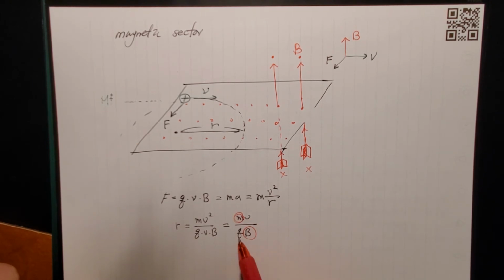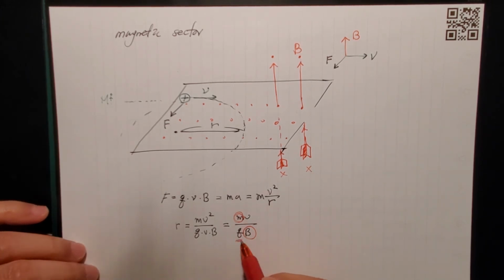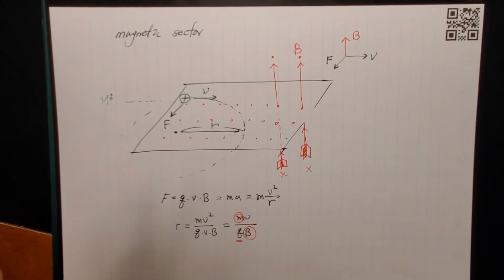And then charge, we assume that is +1. There are cases where you see ions with 2 charges, 3 charges, and that complicates the spectrum. Just like the IR, there are variations, and this causes variation in the mass spec. But it also can serve as an analytical tool if you always think of it the other way.